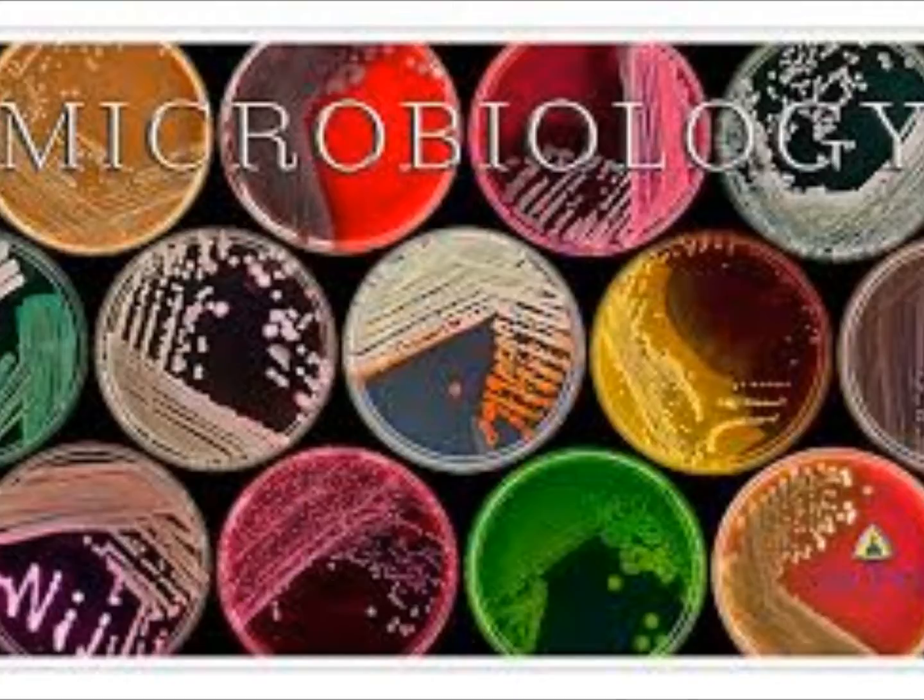So look at your plates real carefully. What you want to do when you're observing for hemolysis is you want to use your light. So it sometimes helps to hold the plate up in the light to see if you see beta. If you see beta, you're going to see clearing around the colonies. The other thing with beta, remember, some it clears wide. Some it's just a little tiny clearing around the colony. So you gotta hold it up. Even a little clearing around the colony where it eats all the blood away is beta. So let the light help you.